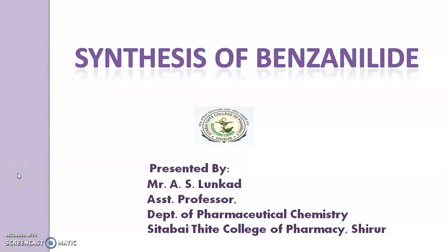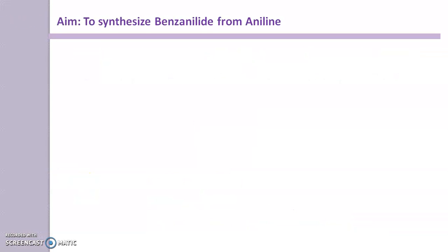In this video, we discuss the synthesis of benzanilide. This video contains the basic principle, reaction mechanism, procedures and calculation of theoretical yield for this synthesis of benzanilide. Let's begin with this synthesis of benzanilide from aniline.